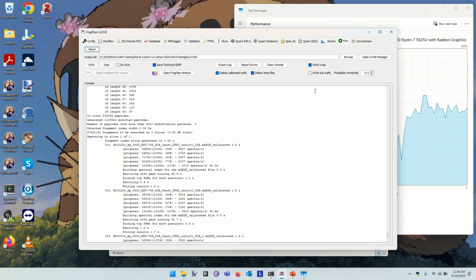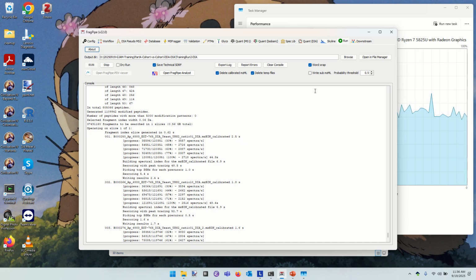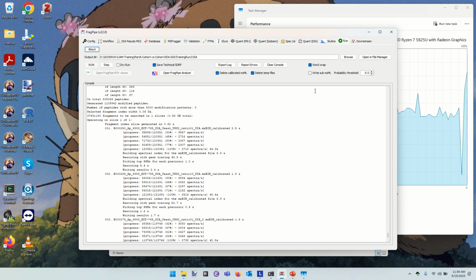We can use that for things like noise cancellation: this fragment ion is observed in this MS, but it's not seen in the scan before it, and it's not seen in the scan after that. Therefore, it doesn't matter as much in identification. It's more likely to be noise, or some peptide that is just a flash in the pan that shows up and then vanishes. This means that we have a much larger collection of tandem mass spectra to work with because of the rate of acquisition. But it does mean that the evidence for a given peptide appears across multiple MS scans, and stitching that together is work.